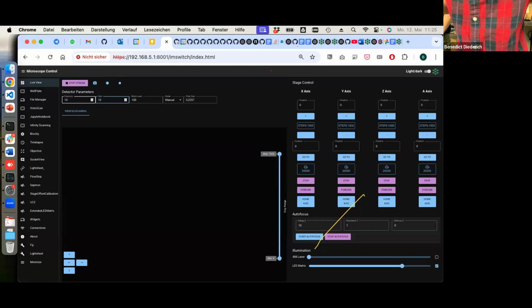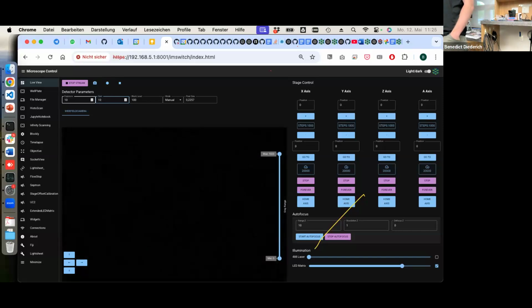If you look, there's a little chamber filled with water, and I also see why there's some light, because there's like a, not chewing gum, but like that. And there are glass windows. Yeah, exactly. If you look from this side here, you can see that it's actually an aquarium. Look from that side here. Yeah, you can find either.